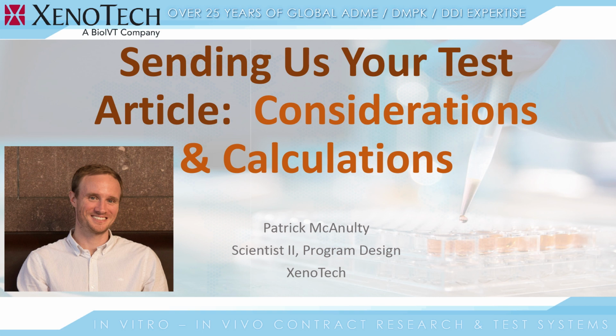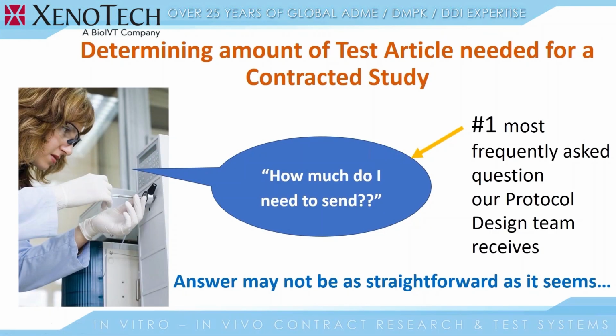And today I wanted to talk to you a little bit about considerations and calculations when you get ready to ship test article for an upcoming study. So how much do I send? That's probably the #1 most frequently asked question that our protocol design team receives. And it seems like such a straightforward question, right?